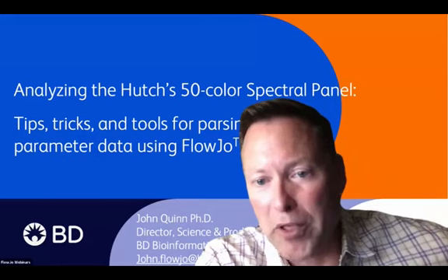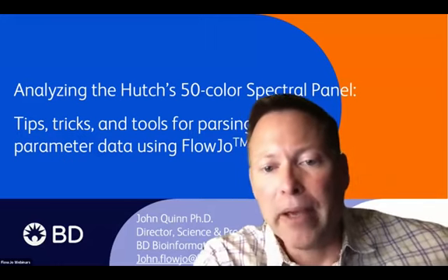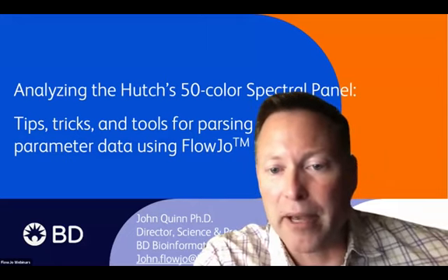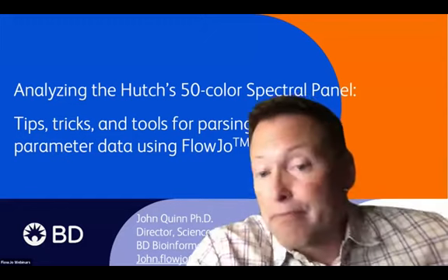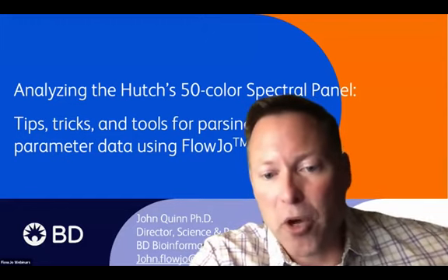This is a talk I gave at AAI a couple of weeks ago. A lot of the focus at AAI was on spectral data across the industry. It seems that we have largely adopted spectral technology as the way to collect high parameter data. And so there's quite a bit of discussion on how do I actually analyze that data. So let's talk through it.